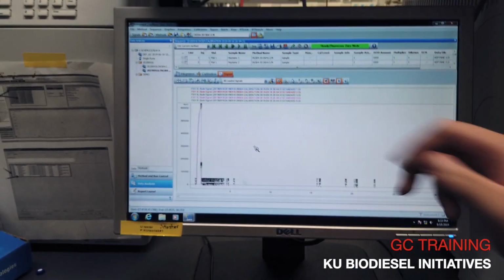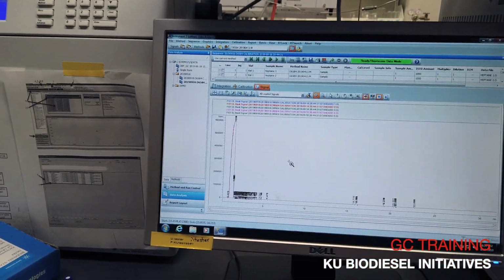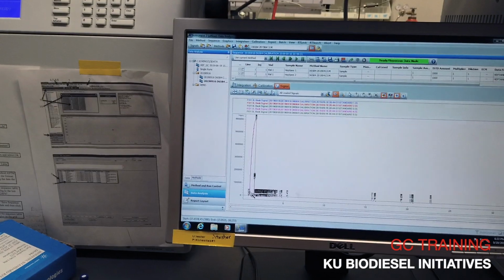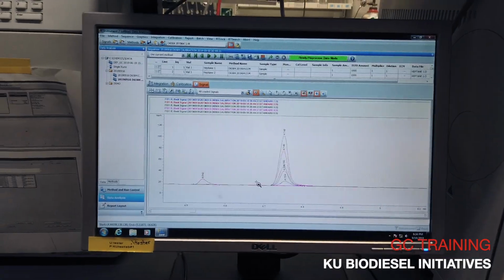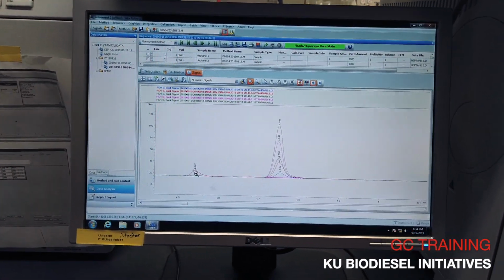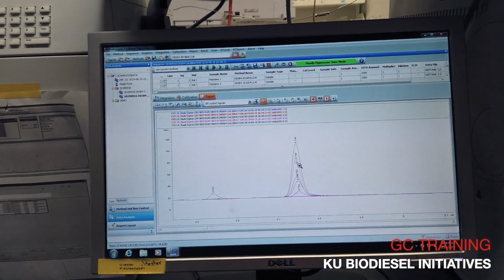And that's the other annoying thing. If you click unzoom, then it'll immediately go all the way out, so you need to be careful with that. So now I'm going to have to go through and do the thin, or this is probably some random crap peak that we have. So we'll just go through and call this our glycerin.